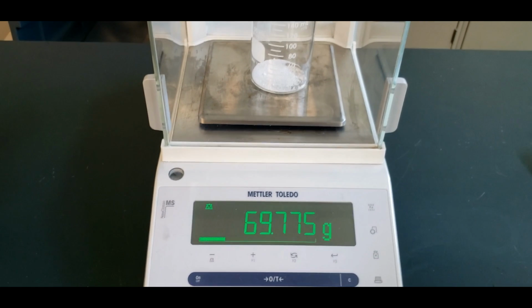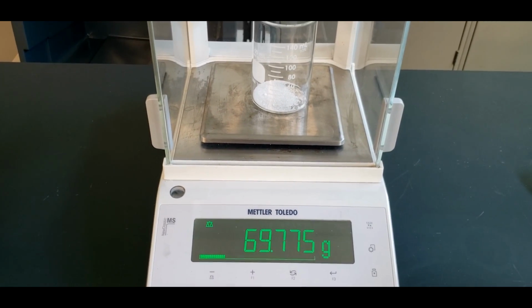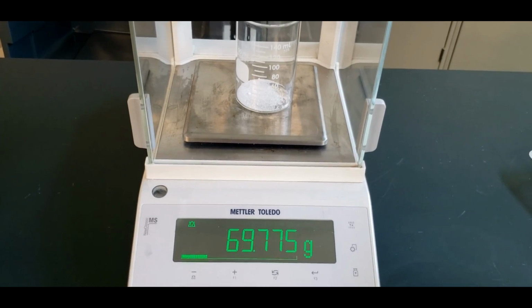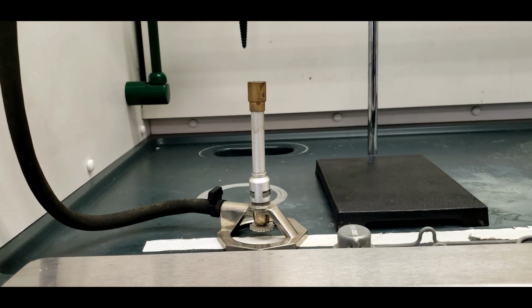Now we weigh the beaker and the unknown. And knowing what the mass of the beaker was, we can subtract that off and find out the mass of the unknown that we start with. So here's our Bunsen burner. We're going to get this going.